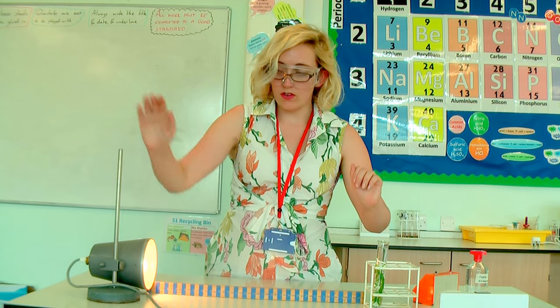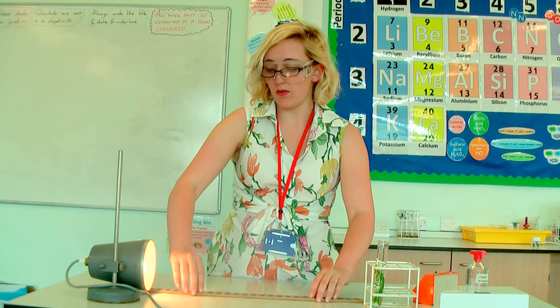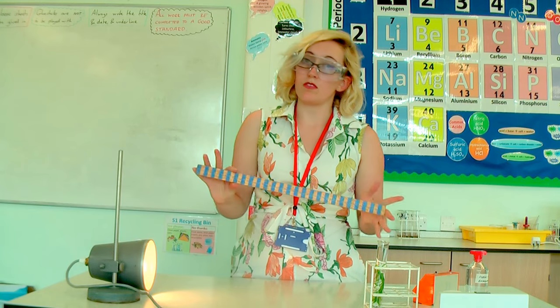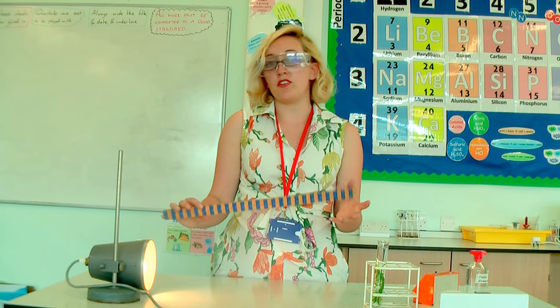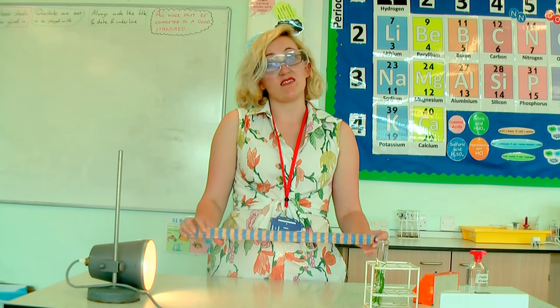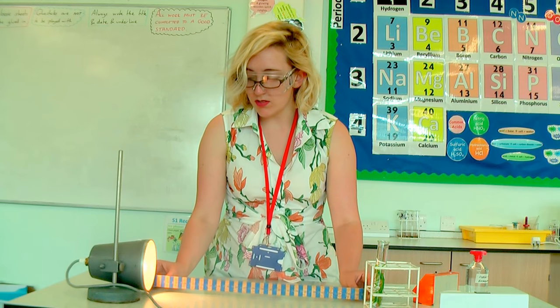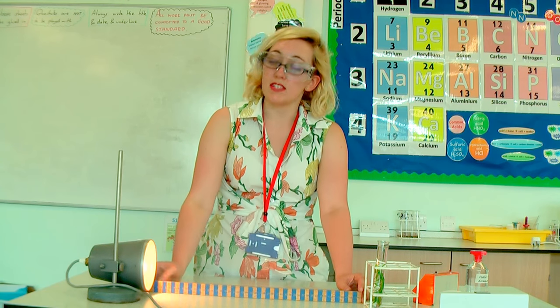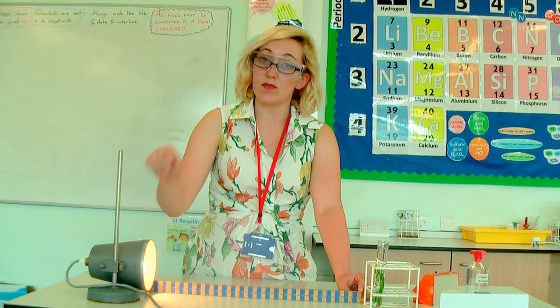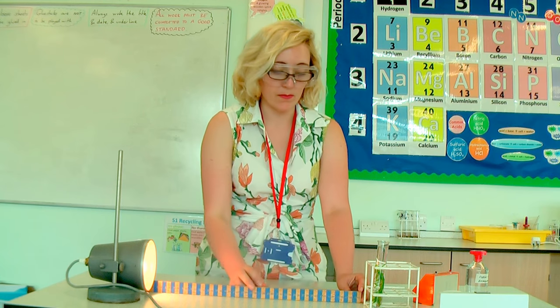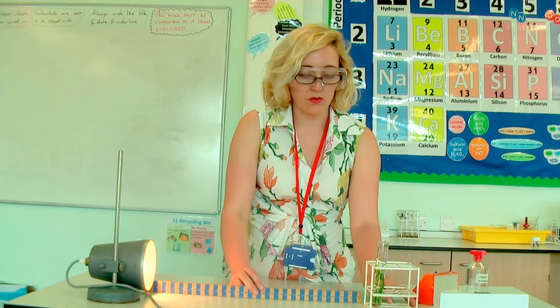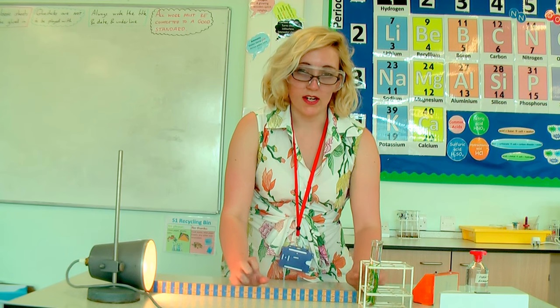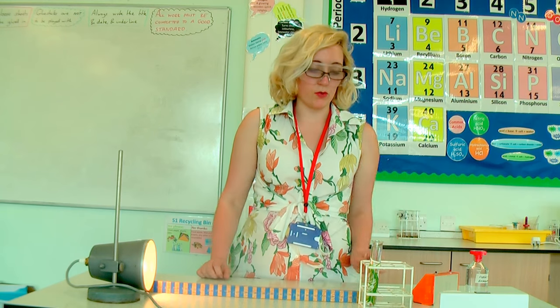I've also got my lamp here and I've got my 50 centimetre ruler. You can use a 30 centimetre or a metre ruler — it doesn't really matter. I use this to measure the distance from the light bulb inside the lamp to the pondweed in its boiling tube.